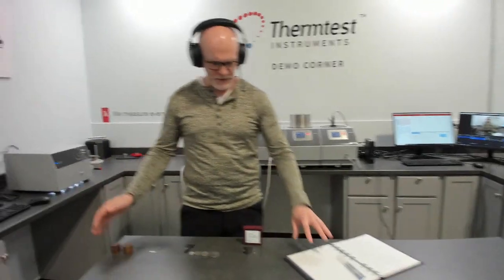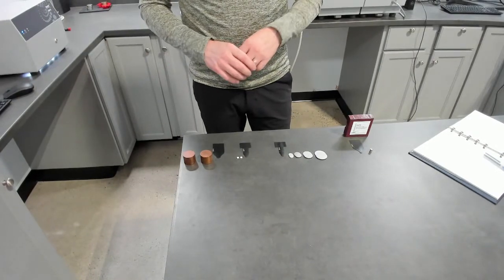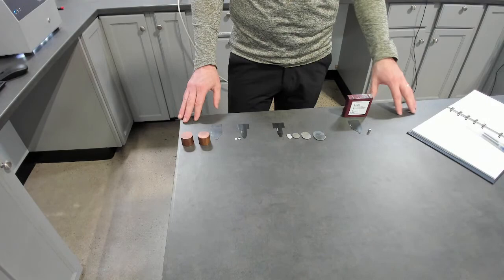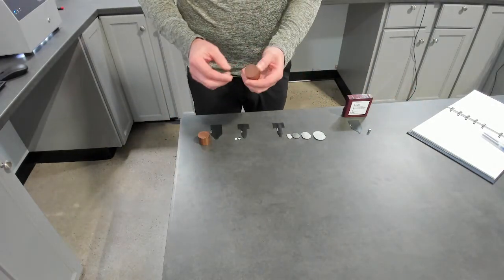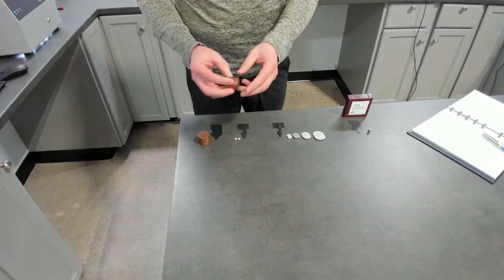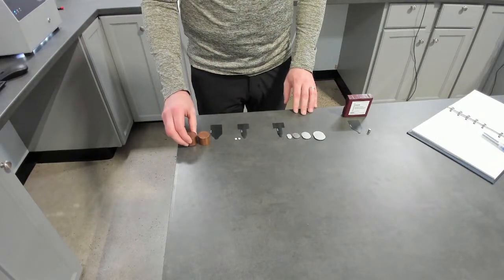So if you bring the camera in, what we're going to talk a little bit about is the importance of variability in test time, both short and long, but today our focus is on short test times. So these look like big samples, but these are copper. These have an approximate thermal diffusivity of around 116 or 117 millimeters squared per second.